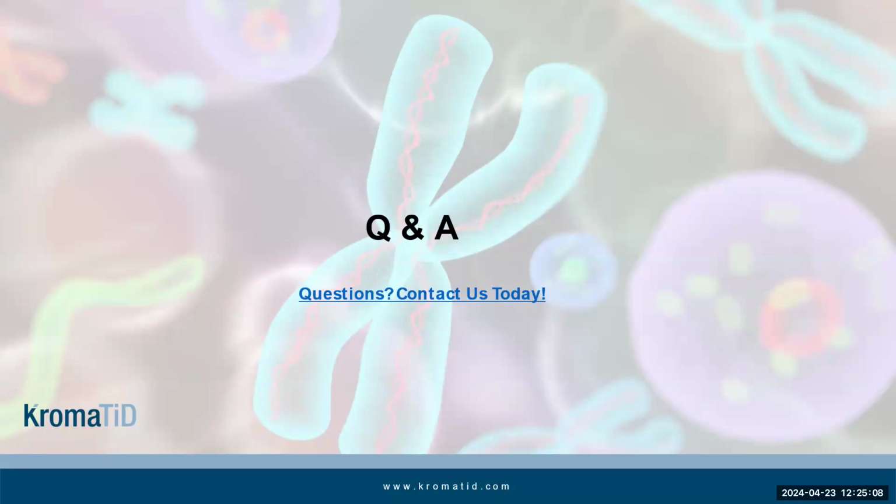I would say that while it's a really good thing to talk upfront about your cell culture conditions and make sure that these two things are compatible, by and large, the method is easy. As long as you know a little bit about your cell culture and how fast it's proliferating, the method is quite easy and most of the time goes off without a hitch.